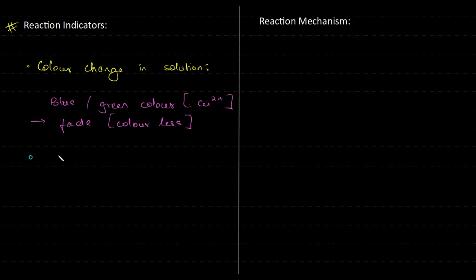Then the formation of the solid. Again here too the same thing, reddish brown. So it's that simple. This will be deposited on the surface of the lead metal. Reddish brown formation of the solid actually. Let me write that. Formation of solid.